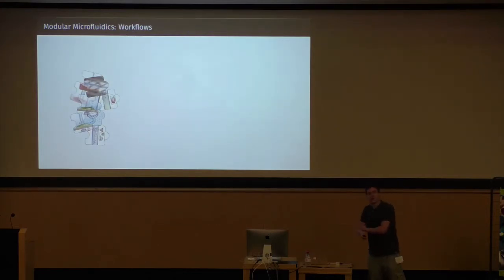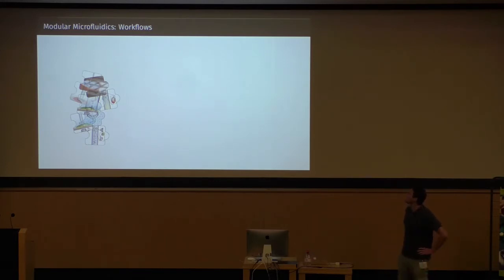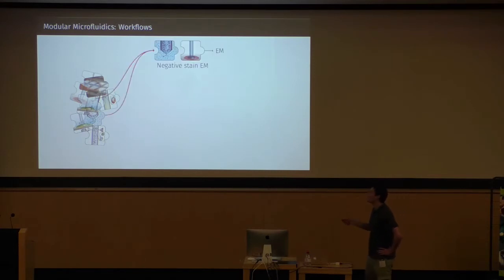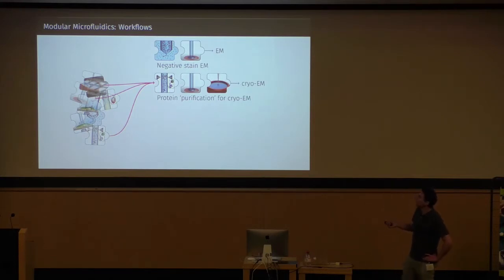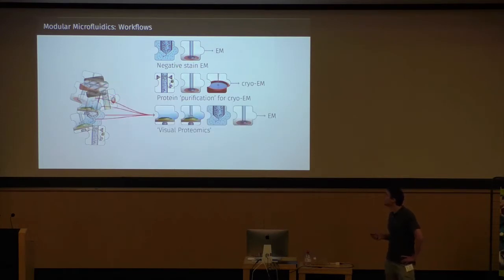So, as I just mentioned, the system is very modular. So you can do many different experiments by choosing the modules you need for your experiments. And I give you now some examples from experiments we are doing quite often in our lab. So for normal negative stain, you would just use the conditioning module together with the handover module. For protein purification by fishing, the module with the electromagnetic trap, then the handover, and then the plunge freezing for vitrification, and then go to the EM.